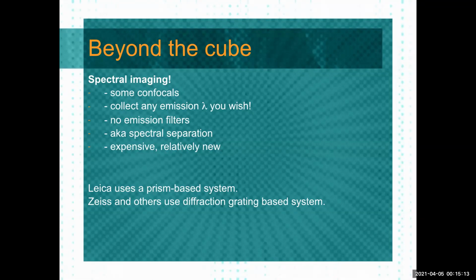But there's a whole system of either prisms or diffraction grating, physics and optics fun, where you can dial into the system which wavelengths you want to see.